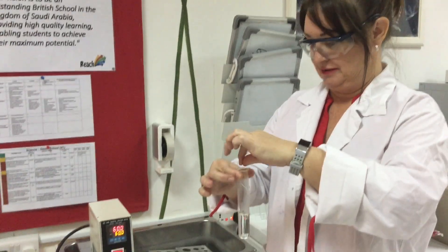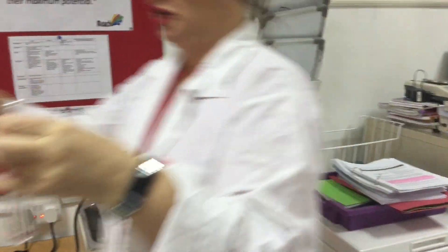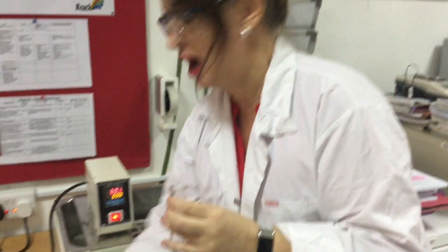I'm going to pop that inside there. It's a little bit tricky because it will go all the way in. Make sure it's fully submerged — I'm going to use some tweezers to make sure it goes down all the way. Now I'm going to start timing. I'm going to leave it in there for four minutes.